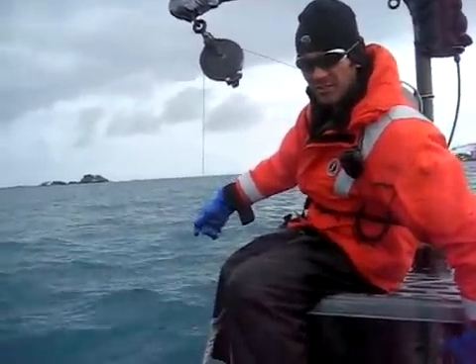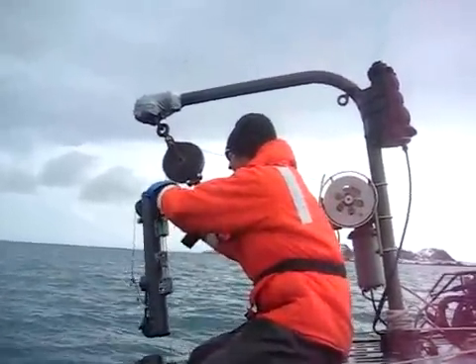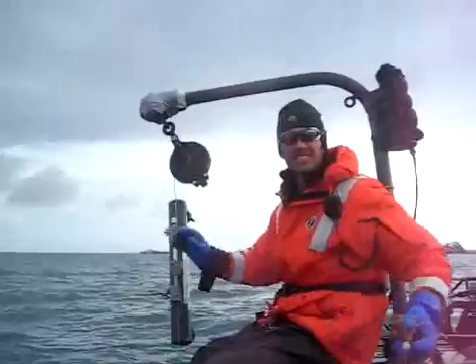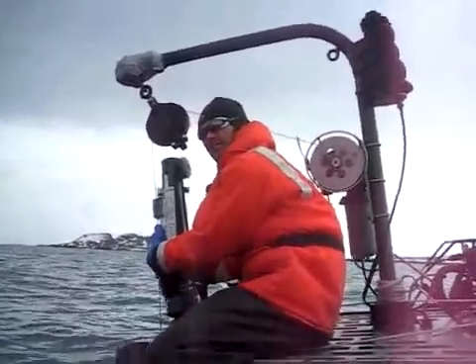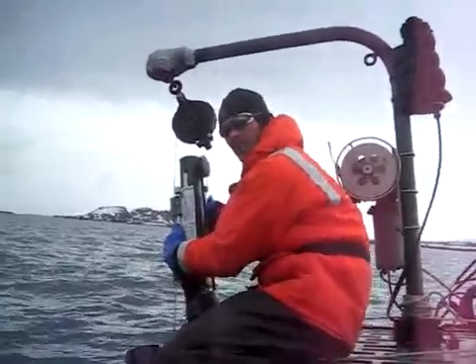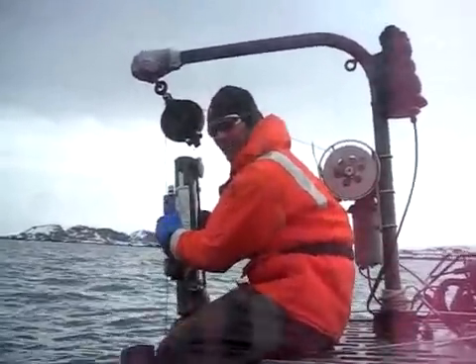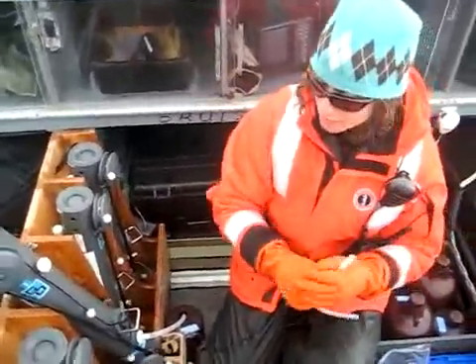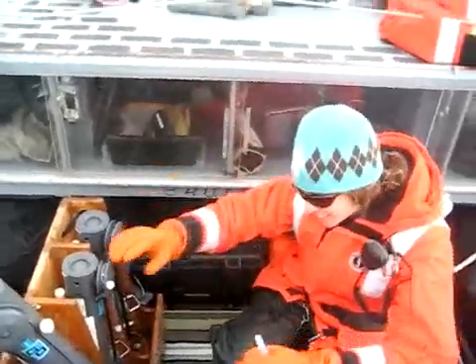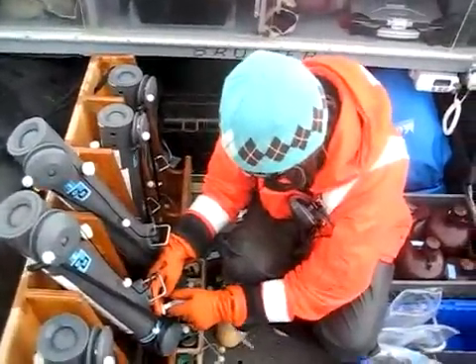Now we just do the reverse of what we did to put them down — we take the messengers off, we unclip the bottles. And then once all the bottles are on deck, Elizabeth will show you how we empty them. Now that the samples are on board, Elizabeth is emptying the GoFlo bottles into smaller plastic amber bottles for filtration back in the lab.